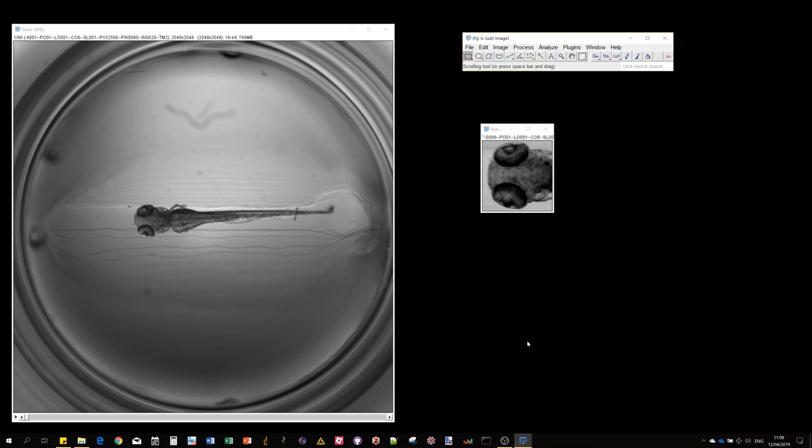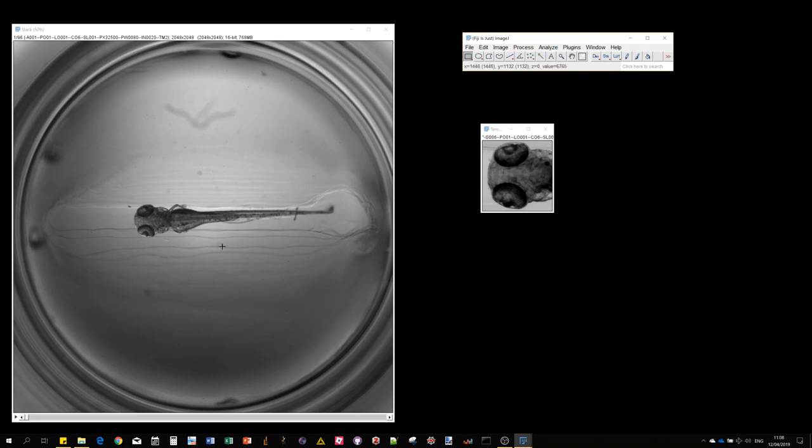Hello! In this first video I'm going to show you how to use the multi-template matching plugin in Fiji to perform object localization in a microscopy image. I will illustrate it with a sample image of zebrafish larvae.